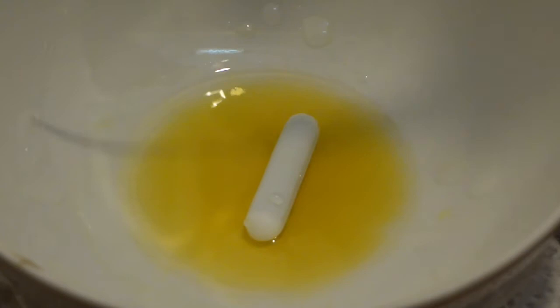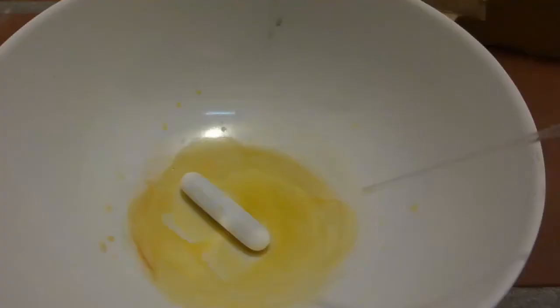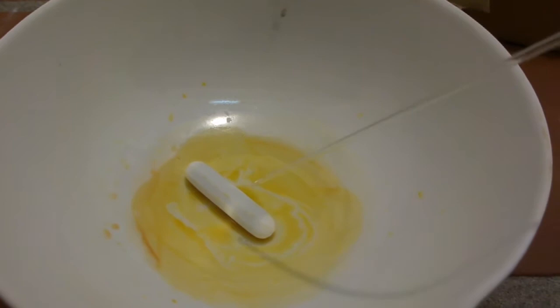This process will consume the nitric acid in reactions, liberating nitrosyl chloride, for example. This is a volatile gas and thus escapes from the mixture. We then boil down the solution carefully in order to drive off hydrogen chloride. Do not evaporate to dryness. In the end, we are left with a slush of chloroplatinic acid. This is dissolved in a minimal amount of water.